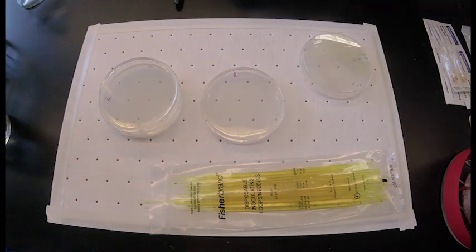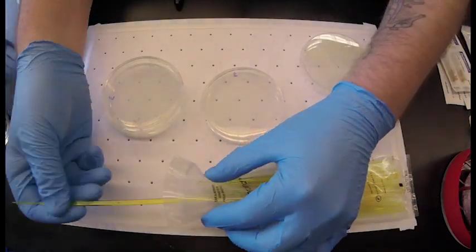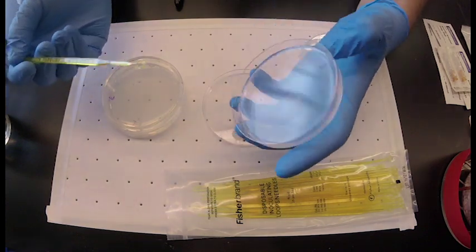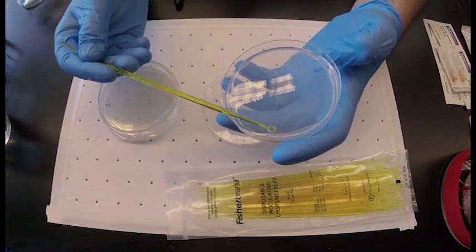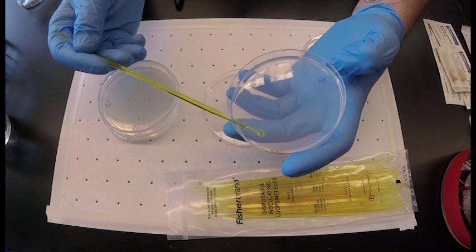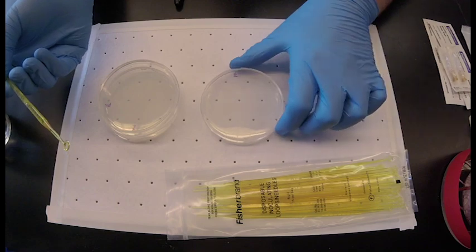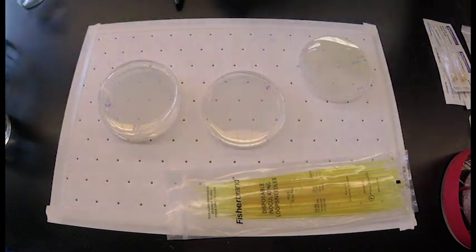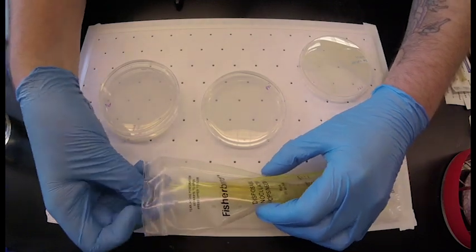For the second streak it is important to use a new loop or to sterilize your loop before streaking in the second zone. It is also important to only cross into a previous zone once in order to dilute the bacteria down to single colonies on the plate.